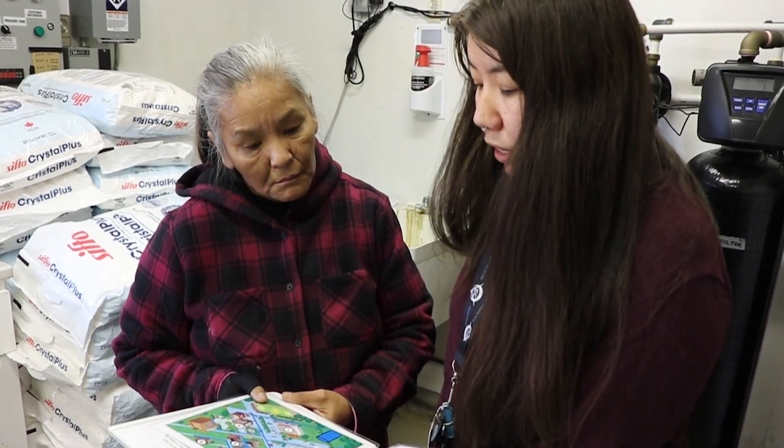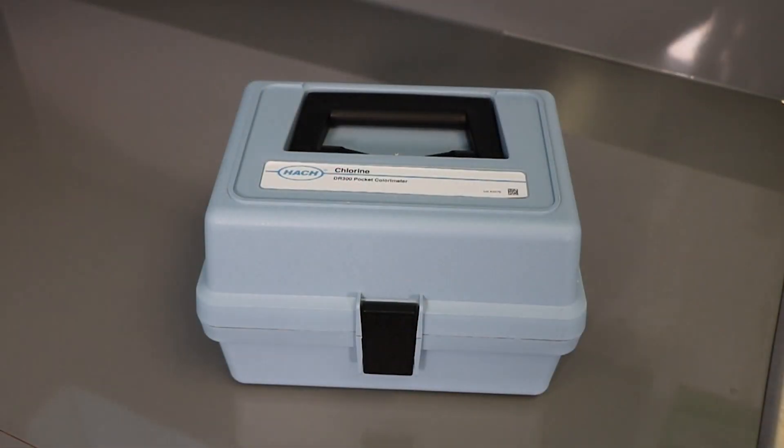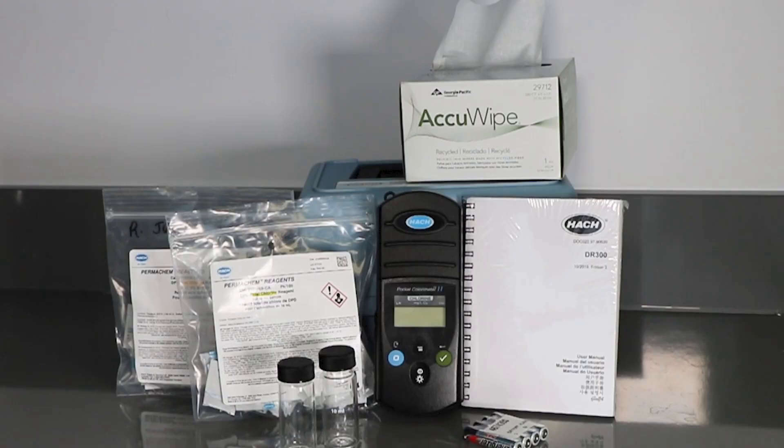Discuss with your environmental health officer where and how often chlorine residuals need to be sampled. The Hach Pocket Colorimeter 2 is a common colorimeter used by community-based water monitors. The colorimeter comes with an instruction manual which describes how to use it and how to troubleshoot problems.